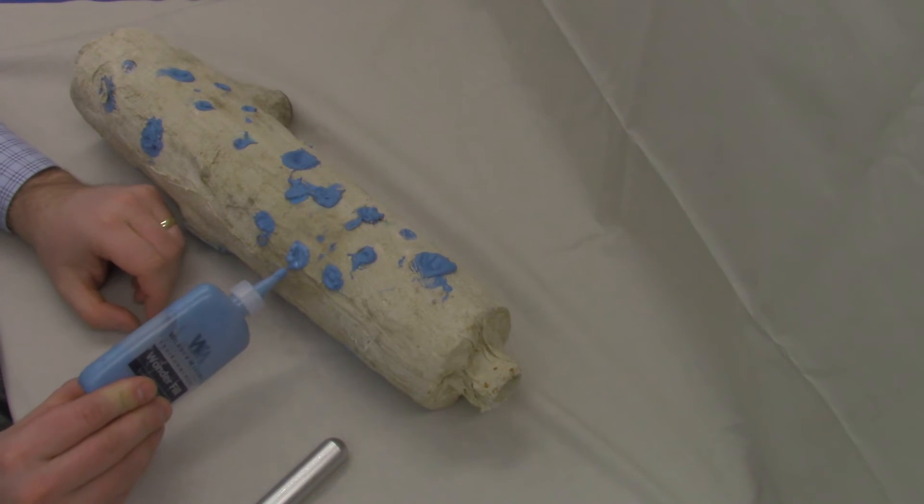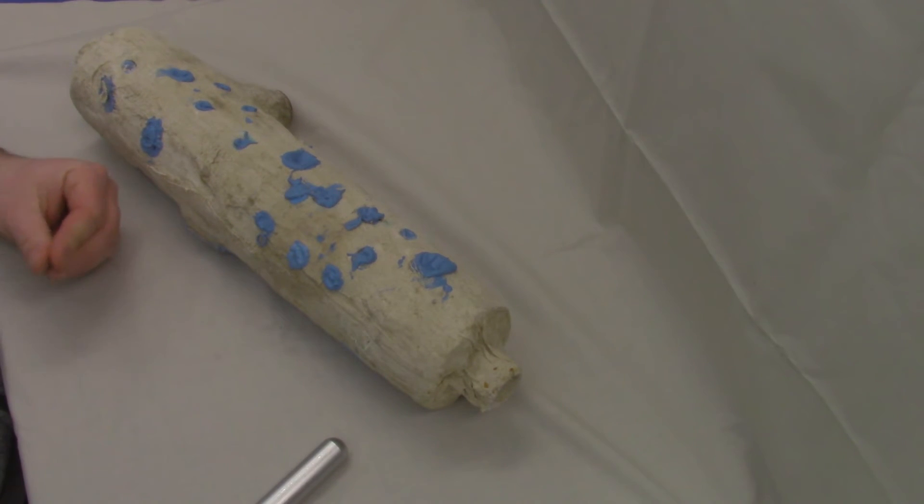Now, gravity is doing a little bit of work on it there, which is making it a little less pretty than it could be, but there you go. That will now dry and prevent any fiber release from that site and continue to allow the pipe wrap to do its job of insulating the pipe until it's eventually abated.